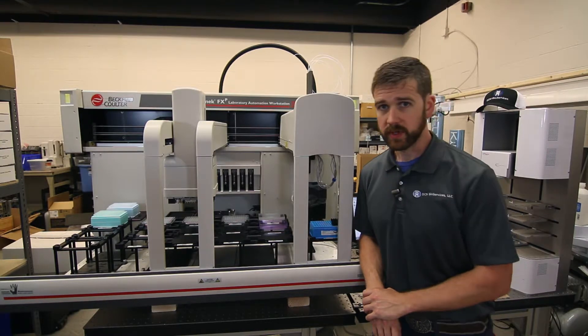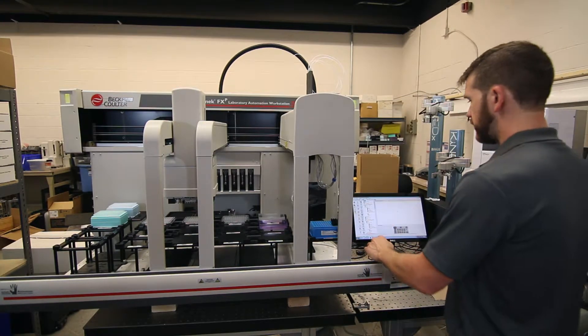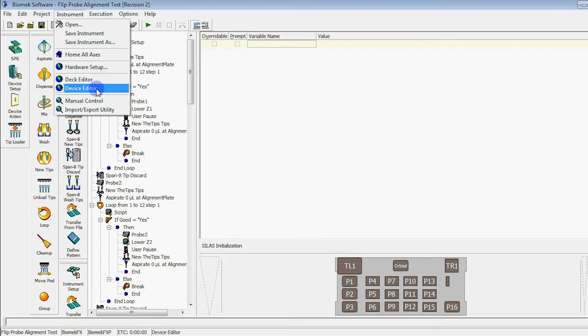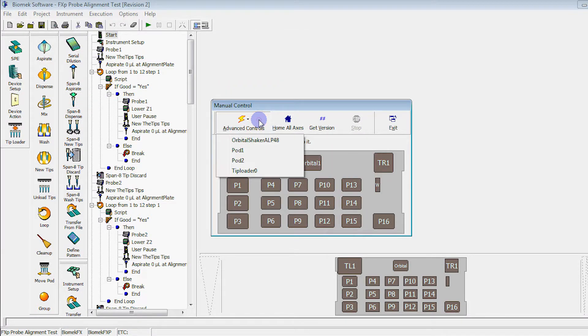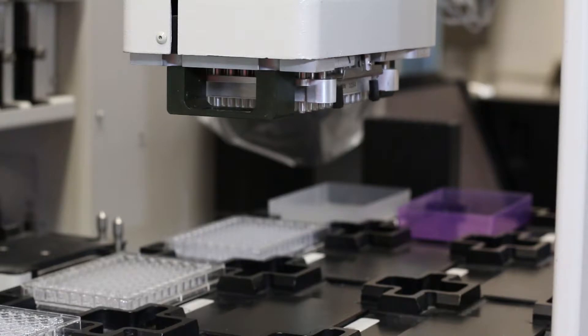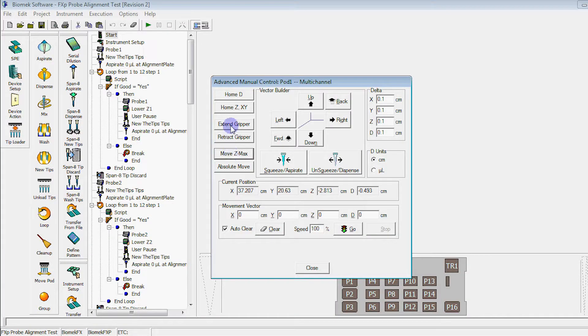To get started replacing them, we'll need to first get the grippers extended. To extend the grippers, go to Instrument, Manual Control, select your multi-channel pod. First, click Move ZMAX and then Extend Grippers.